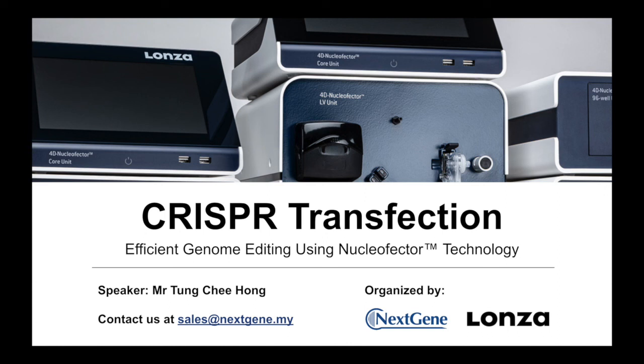Yeah, we have another question from Masani. Nice talk. Are there any works or literature using Nucleofector for plants? Oh, okay. So thanks for your question. Unfortunately, Nucleofection currently only works for mammalian cells. So if you are working on plants, maybe you can contact us separately.